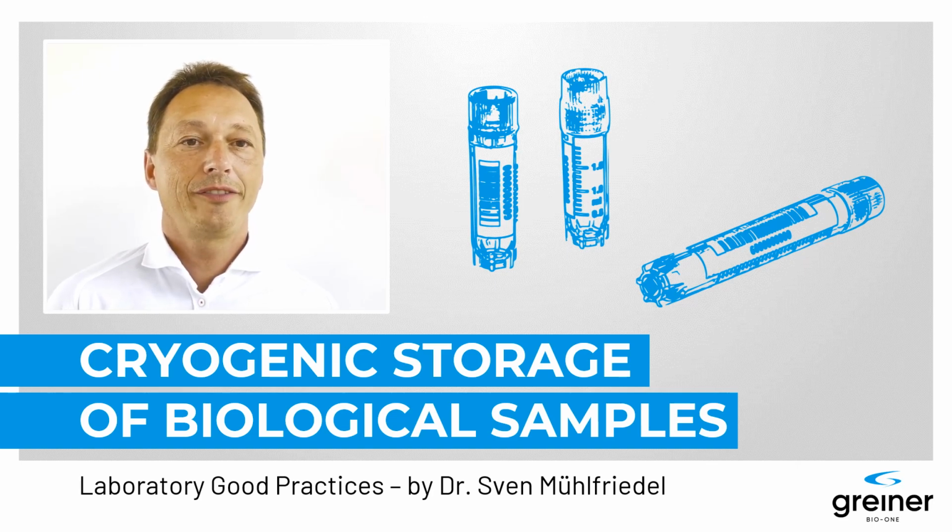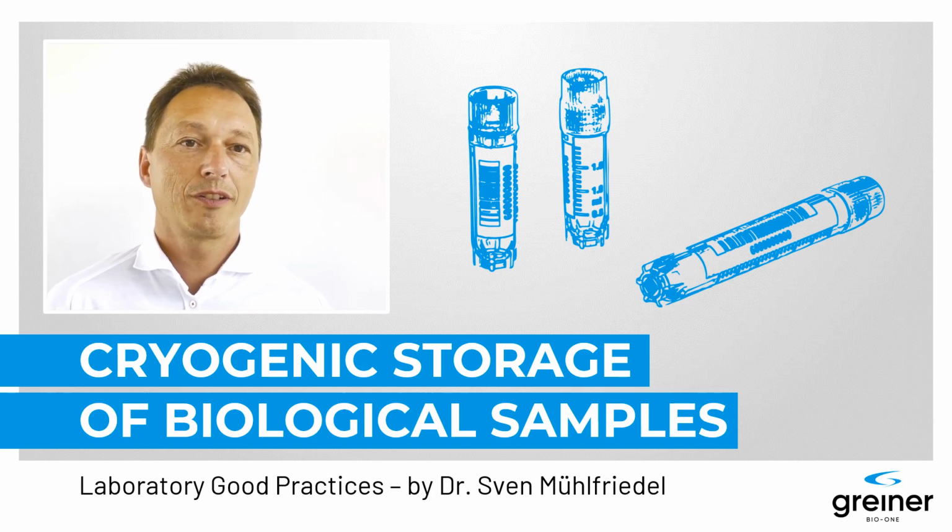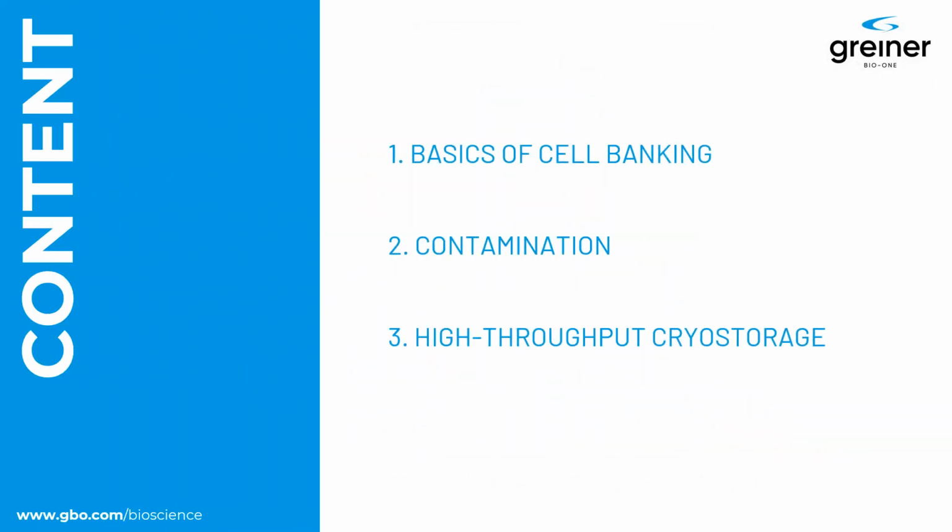In today's second event of our webinar series, I'm going to talk about the cryogenic storage of biological samples. In case you have any questions, please refer to the end of my presentation when contact information will be provided. My presentation is divided into the three parts: basics of cell banking, contamination, and high-throughput cryostorage.